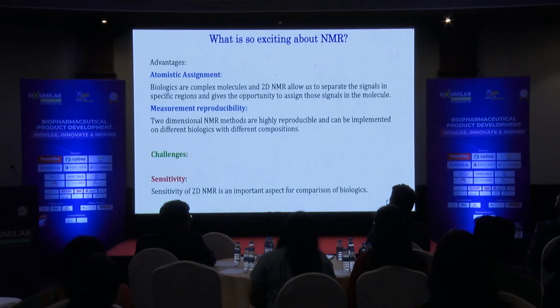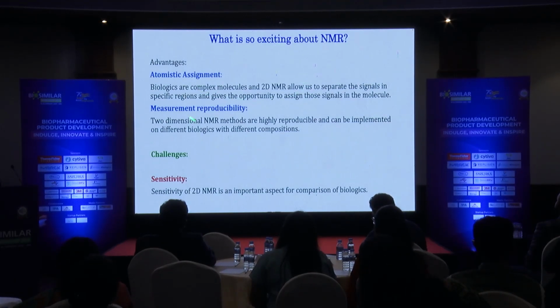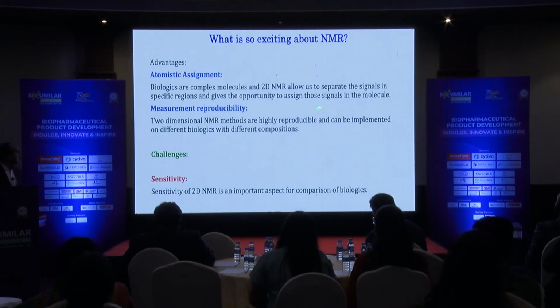Next, please. Now, why NMR is important, that's what I'm going to illustrate more. It's one of the robust techniques that give you detailed information about a complex biological molecule. The great part is that it can give you atomistic assignment. Doing the multidimensional spectrum, you know information about each residue, even the atom in the residue. If we do, say, 2D NMR, we know from each residue where the signal is coming from, and that gives us the opportunity to compare your innovator product with the biosimilar product. It's a highly reproducible technique.